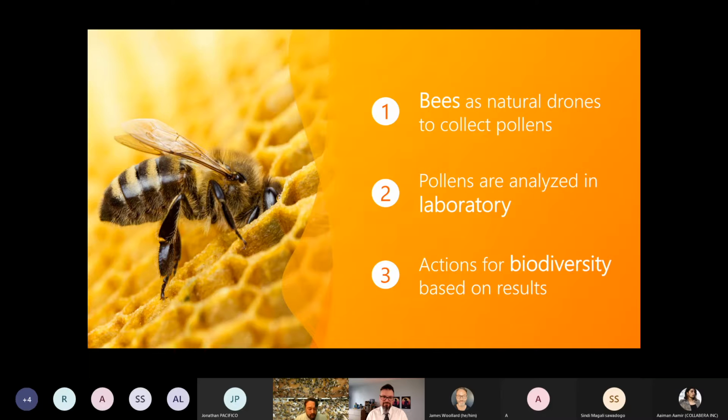But what we wish is to improve our impact for the next generation. That is why we thought that artificial intelligence can really help us to identify the origin of the pollen, to identify the pollen, and to measure the biodiversity. Then, just to finish, thanks to Avanade, thanks to Microsoft, and specifically thanks to the program Share AI, we are working on it. Thank you very much to them, and I will let them explain in more detail the technical aspects of what we developed together. Thank you very much.